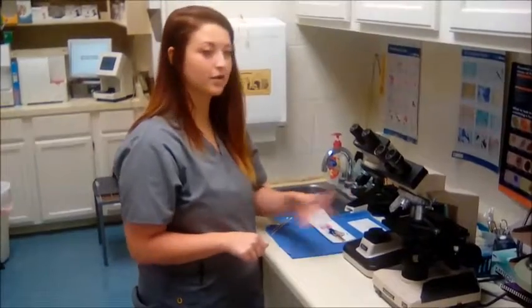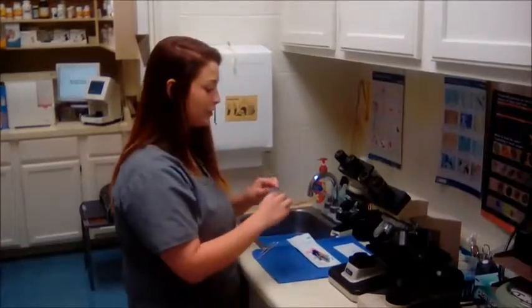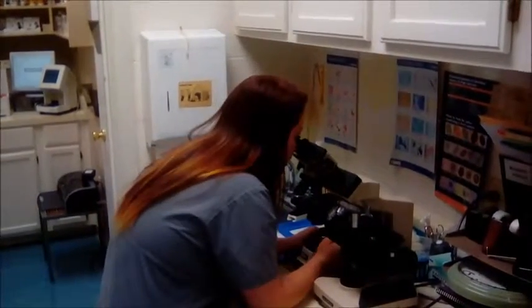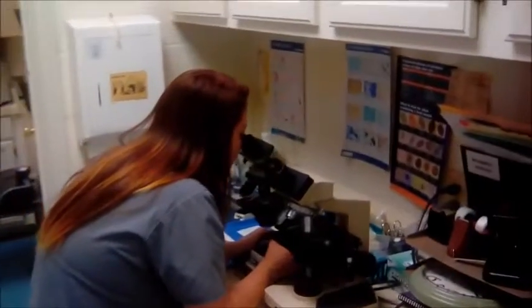Okay, I'm back at the microscope and my sample has air dried. So I'm going to go ahead and take it and I'm going to turn on the microscope and I'm going to start off by putting it on 10x. And I'm just going to focus in where it's stained at.